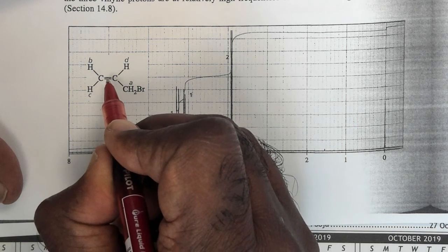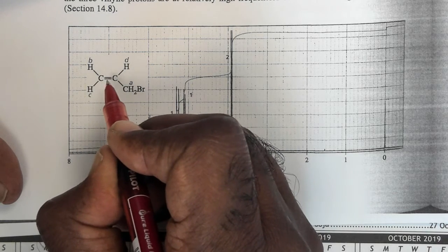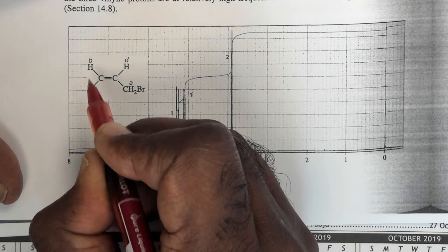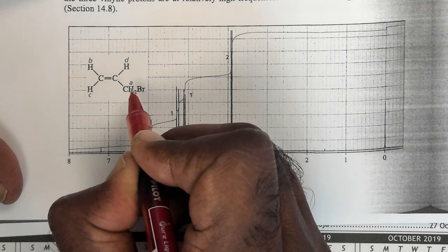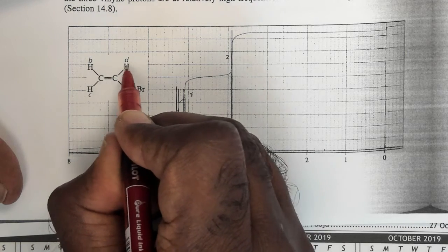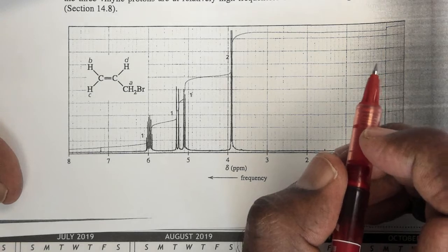Ordinarily, if I had a single bond here, the protons on here would be equivalent because of rotation around the single bond. But because the rotation is restricted, these two protons behave differently, because the C proton now sees the A protons next to it, and this B proton sees the D proton next to it on that side, and on the same carbon the B and the C see each other. So we call this coupling in a double bond.